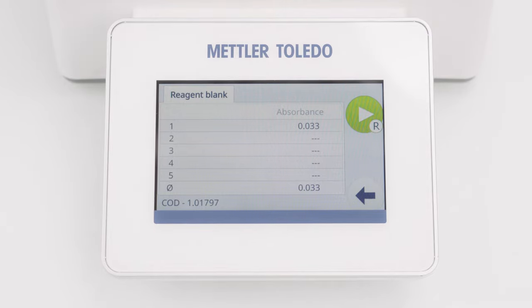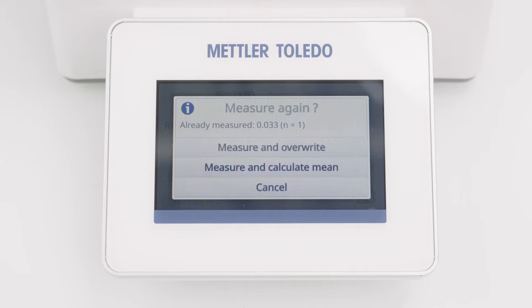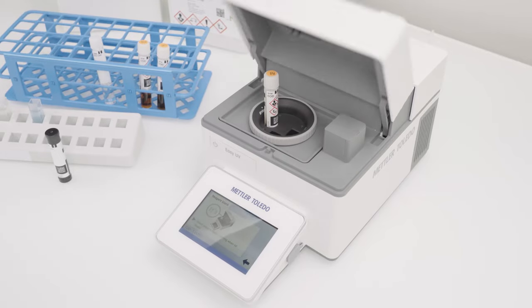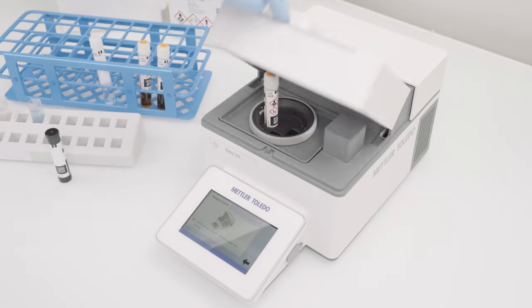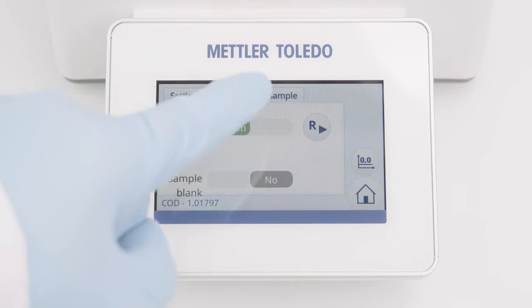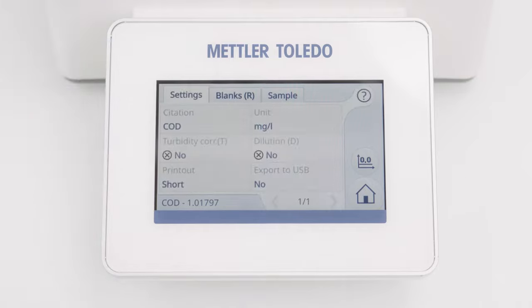By clicking the Start button, I can repeat the measurement and the instrument calculates the mean value of the replicates. By clicking the Back button, I am confirming the Reagent Blank measurements. The letter R indicates the activated User Reagent Blank.